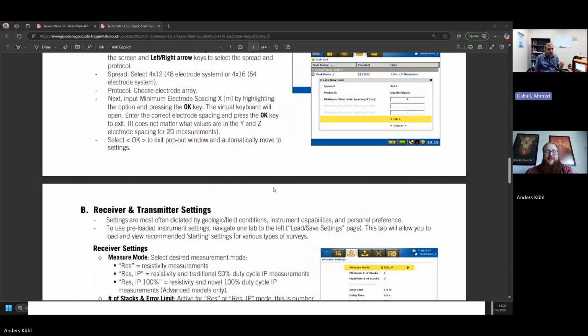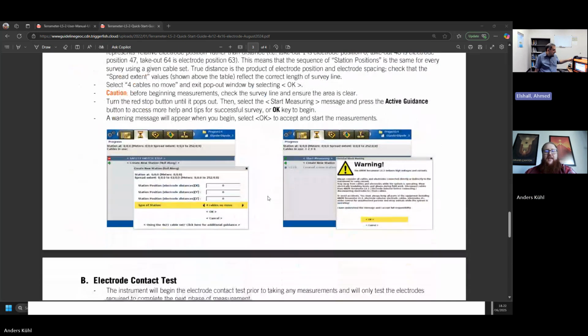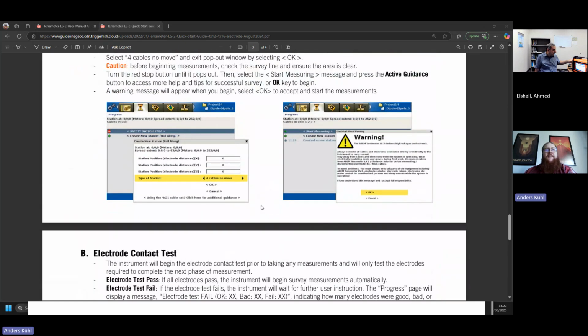Also, when you do this, you need to set the switch. Is that what you said? If the switch is not depressed, it will just measure. But if it is depressed, it will give you this warning, safety switch stop. So it will refuse to measure essentially. That means you need to take out the safety switch.